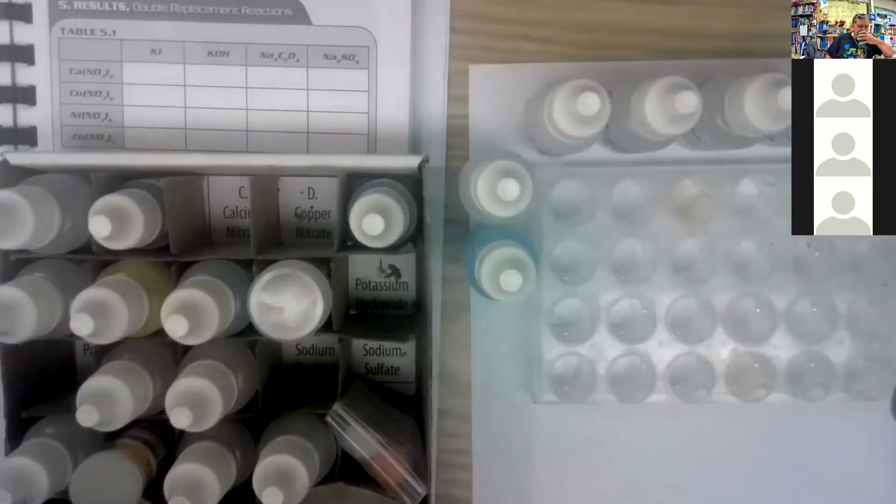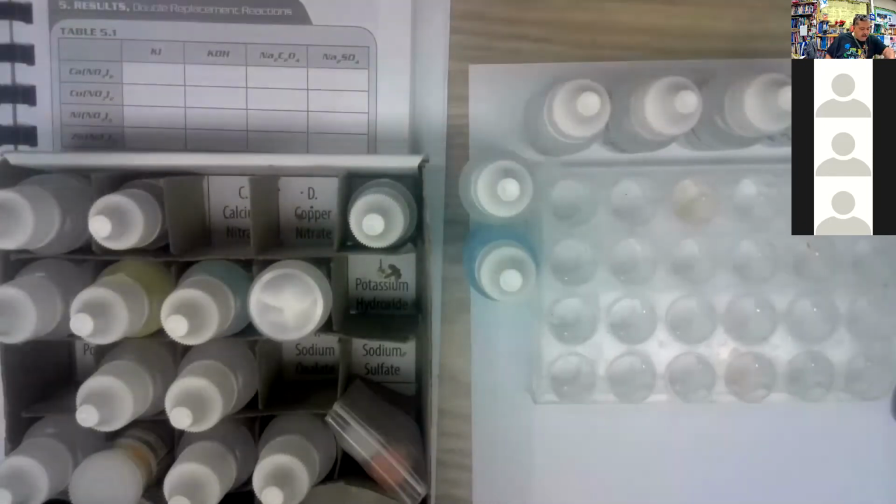The third one, we'll focus that, is nickel nitrate. Now the nickel nitrate, where's that? Nickel nitrate is in the second row, third over. Right there. And then the fourth one is zinc nitrate. Where is that? Zinc nitrate is in the fourth row, third column. So 1, 2, 3, 4, third column over. So we got all our chemicals set up.